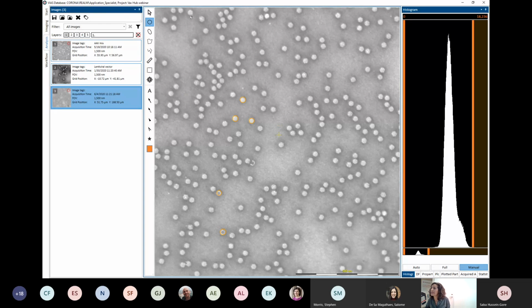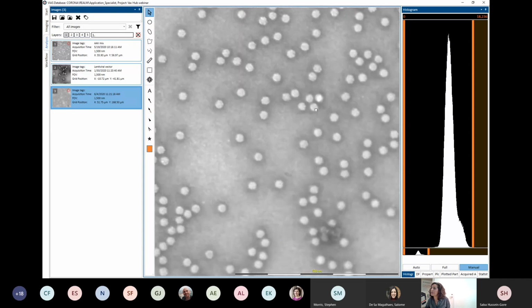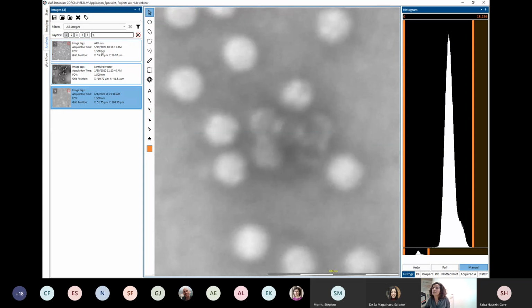And then maybe I'm curious, or I want to tell my colleague about this thing here. So I can zoom in. It's a bit blurry here, but I can do something like this. Hang on. Let me just do this really quickly. Sorry, I just clicked on that. I'll do this again, a bit slower.